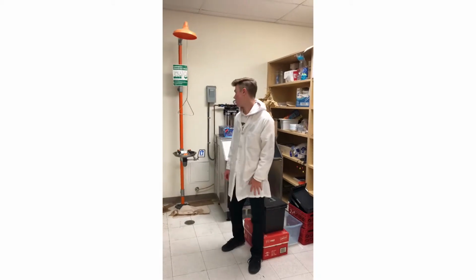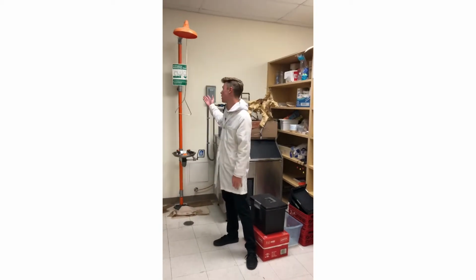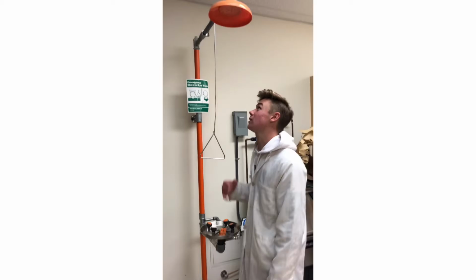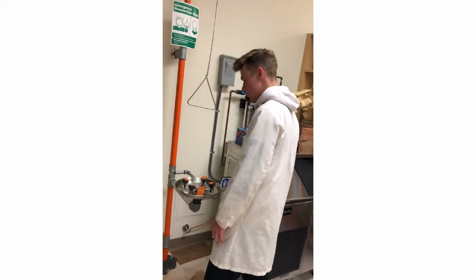If you come in contact with a dangerous chemical, immediately strip off all possible clothing and go to the emergency shower / eyewash station. After all clothing is removed, pull handle once when you're directly underneath the shower head and push forward on this panel with eyes over it for at least 15 minutes or until the instructor comes and gets you.